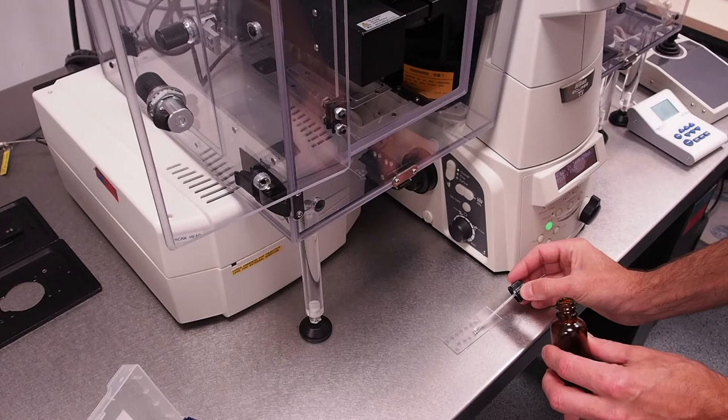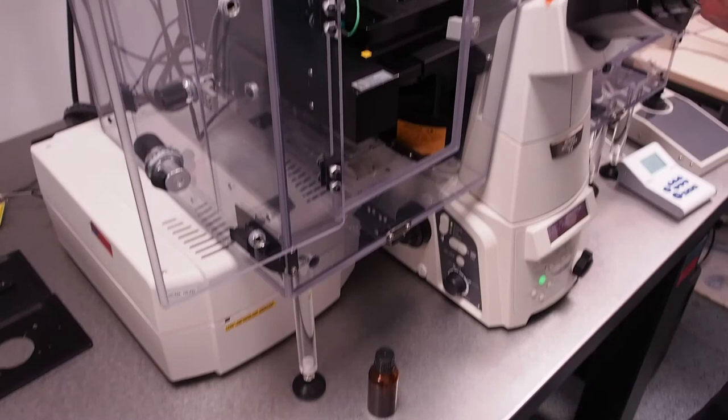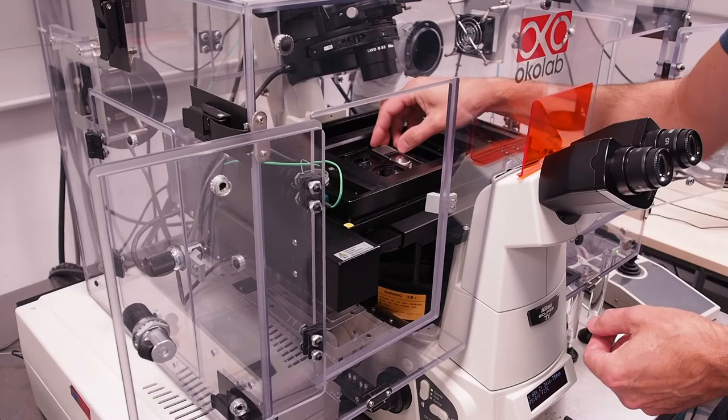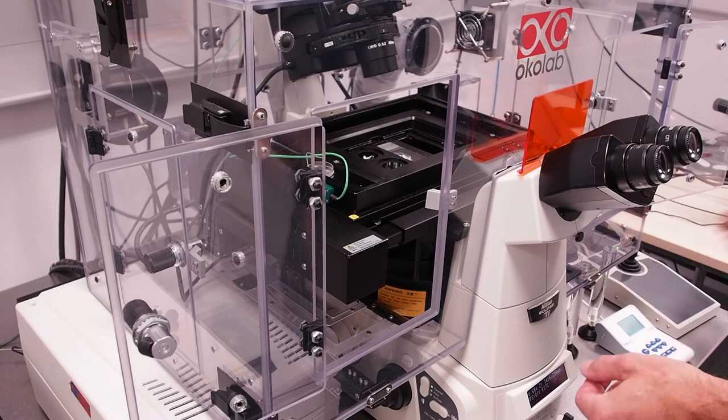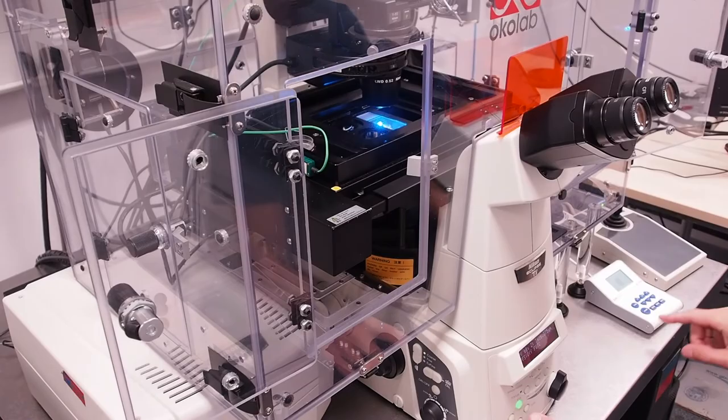Bring your sample to the stage and insert your sample into the stage holder, cover slip downwards. Bring the condenser arm forward again and find your sample as just described for the air objectives.